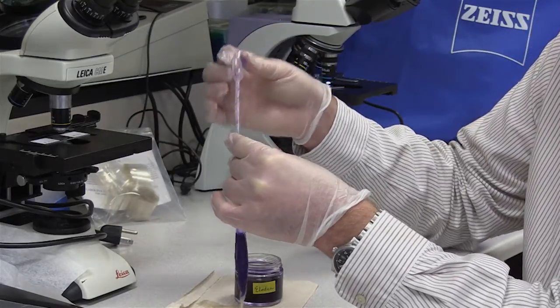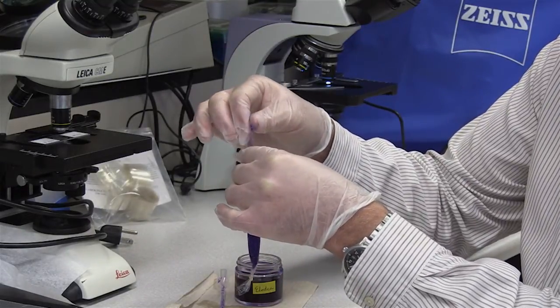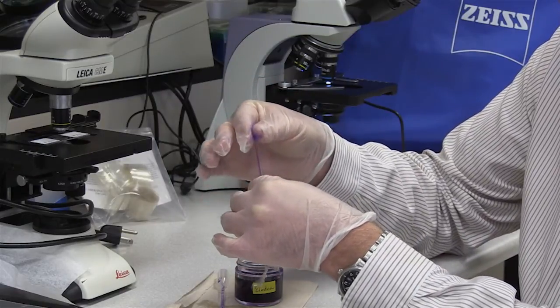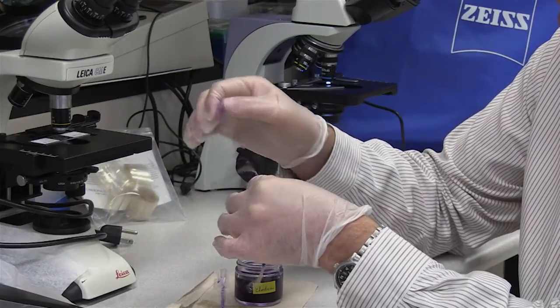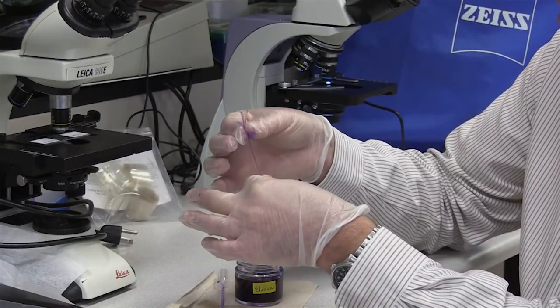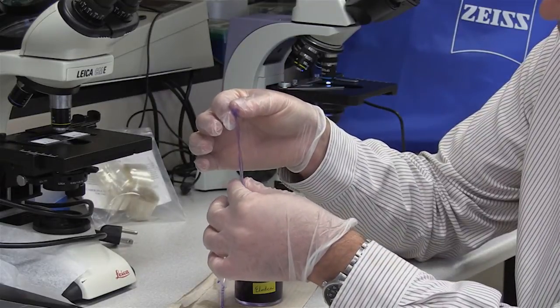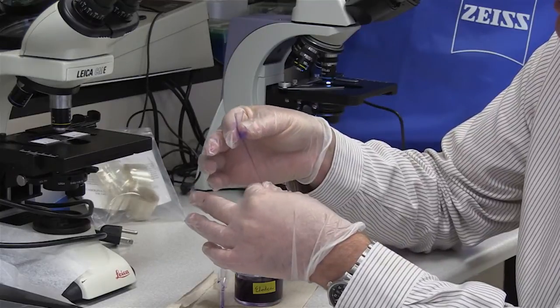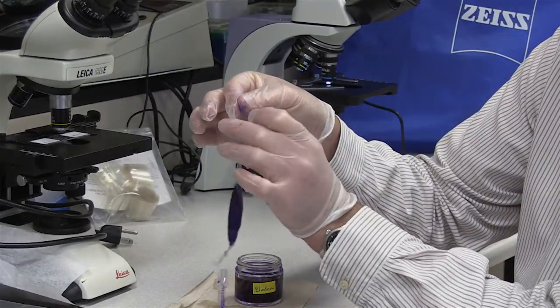Okay, so now you see we have the tube about half full of our water. Now, the next step is very important when making the cell. You want to draw the unfilled portion of the tube between your fingers to eliminate as much air as possible. Now, I still have a little bit of air in there, but I can pinch it, draw it between my fingers, and so now I have very little air in our cell.